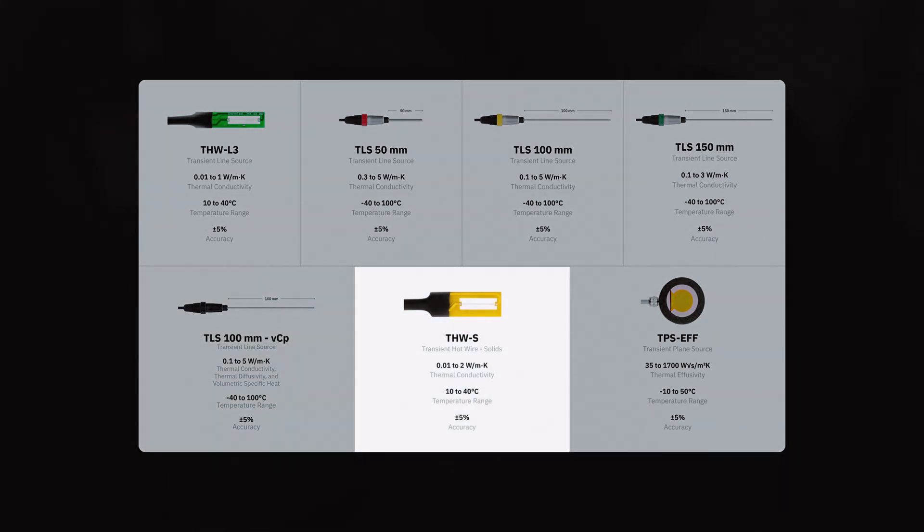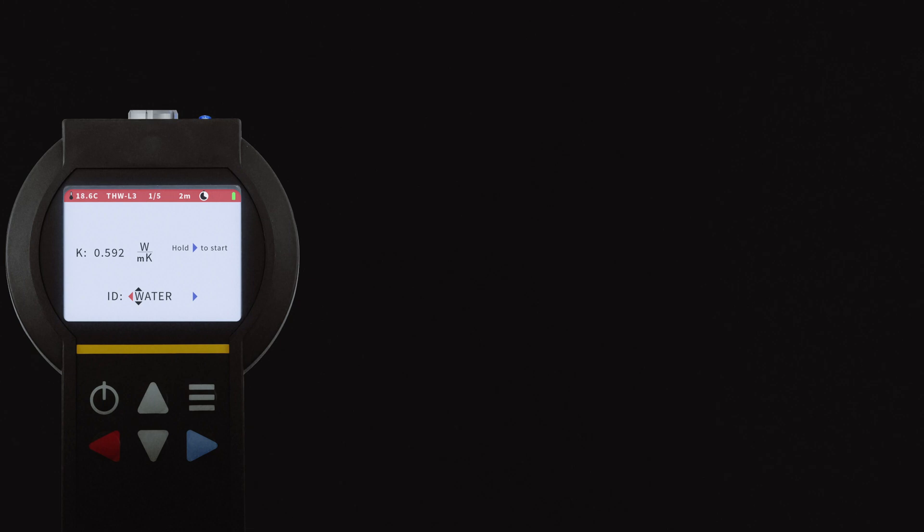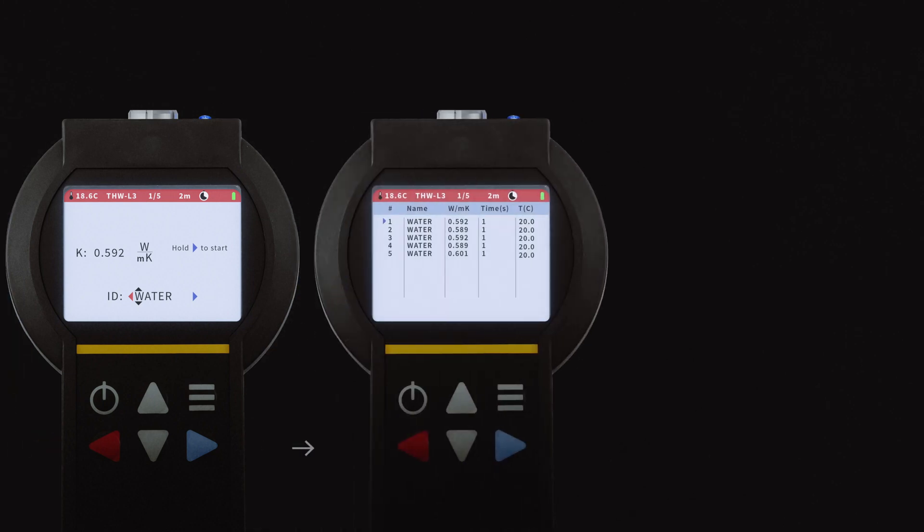Lastly, the THWS is ideal for measuring small homogeneous insulation or gasket type materials. Measurements with the MP2 can be activated individually, auto-scheduled on the device, or with the included software utility program.